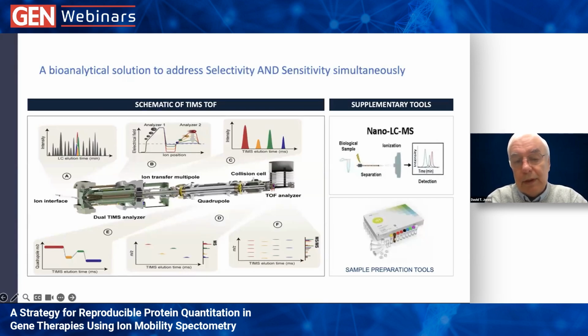And it's really a remarkable thing. With powerful software and sequence analysis, you're really zeroing down and sorting through a huge mess of proteins. In this instrument, you might see 8,000 proteins in a single run, and you'll know exactly which one you're looking for and be able to tell you how much is there and what it looks like. So it's very powerful.